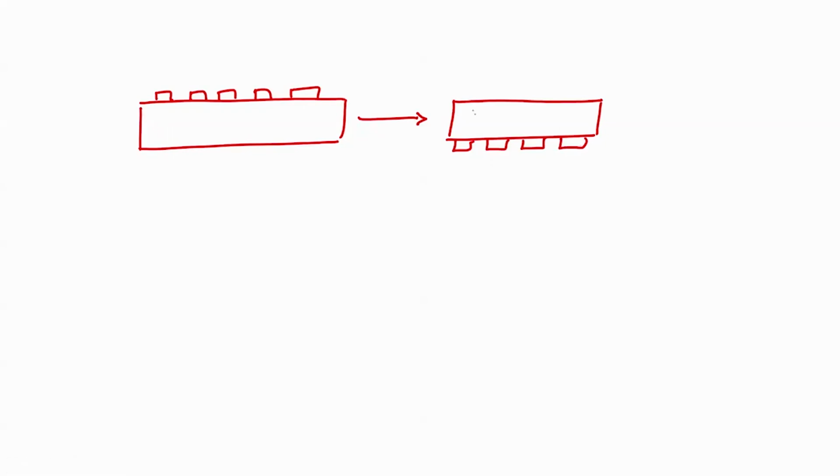Now, on the top you screen print interdigital electrodes. What you have done? First step is you screen print the heater on the plastic substrate, then you rotate the substrate 180 degree and you screen print interdigitated electrodes.